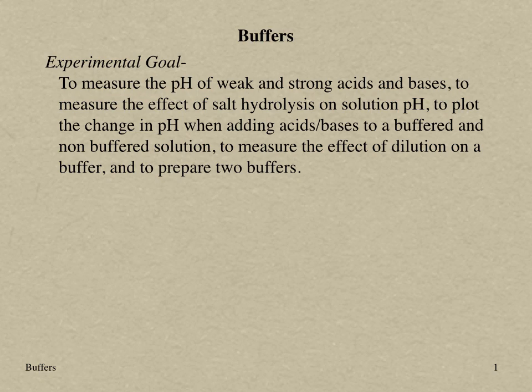Goals of the buffers lab include measuring the pH of several acid and base solutions, determining the effect dissolving a salt has on the pH of a water solution, plotting the pH of buffered and non-buffered solutions when adding acid or base, determining if dilution of a buffer solution has any effect on its pH, and preparing two buffers.